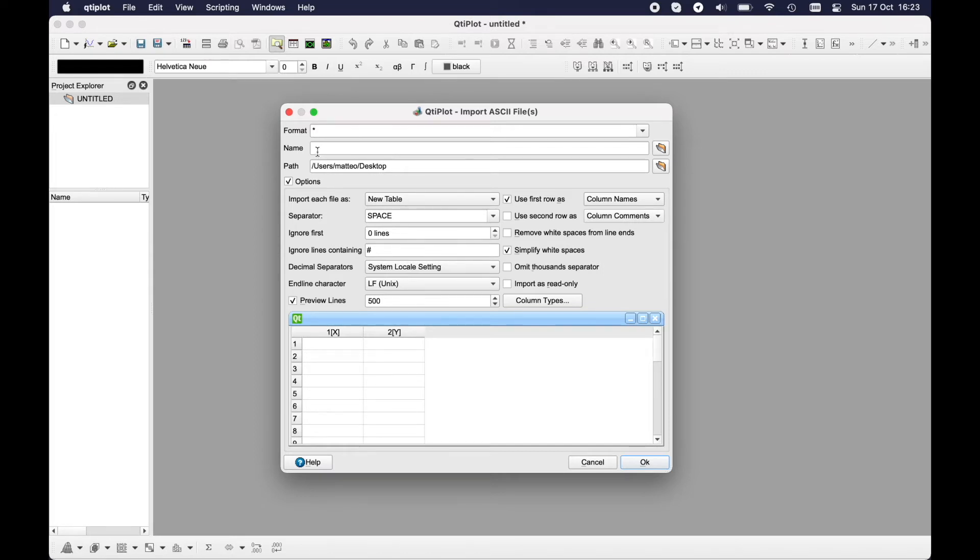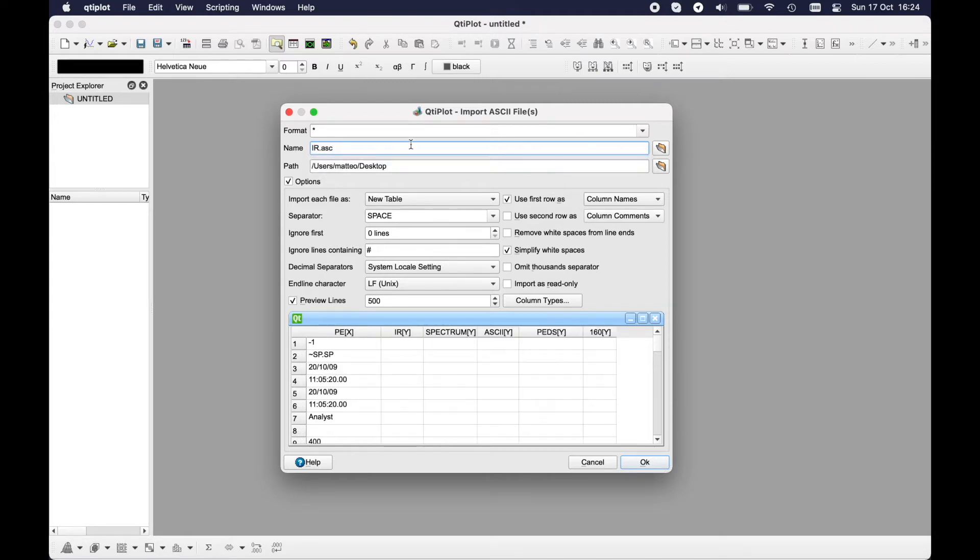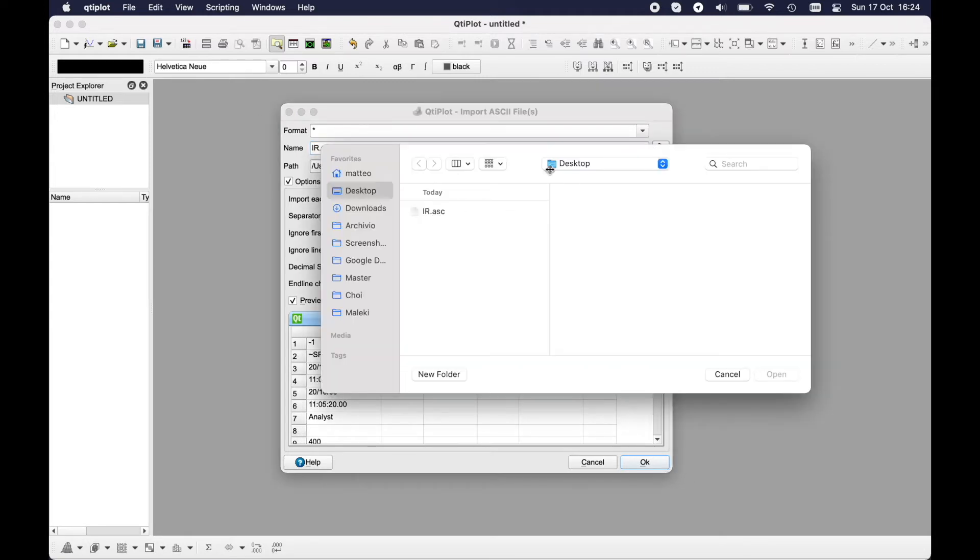About the name, I have only one file, so as soon as you type, QtiPlot is suggesting what you might import. In this case I have only one file but you can also click here and select how many files you want.